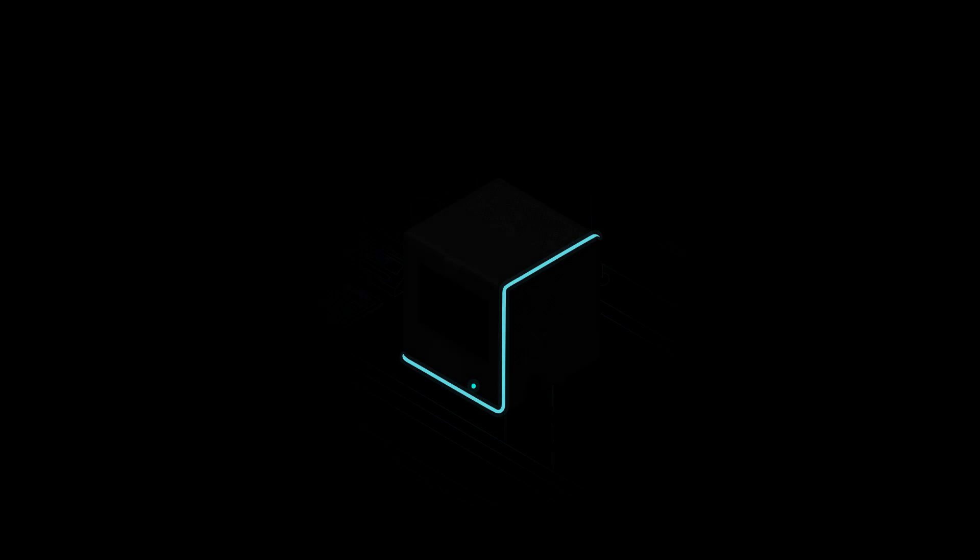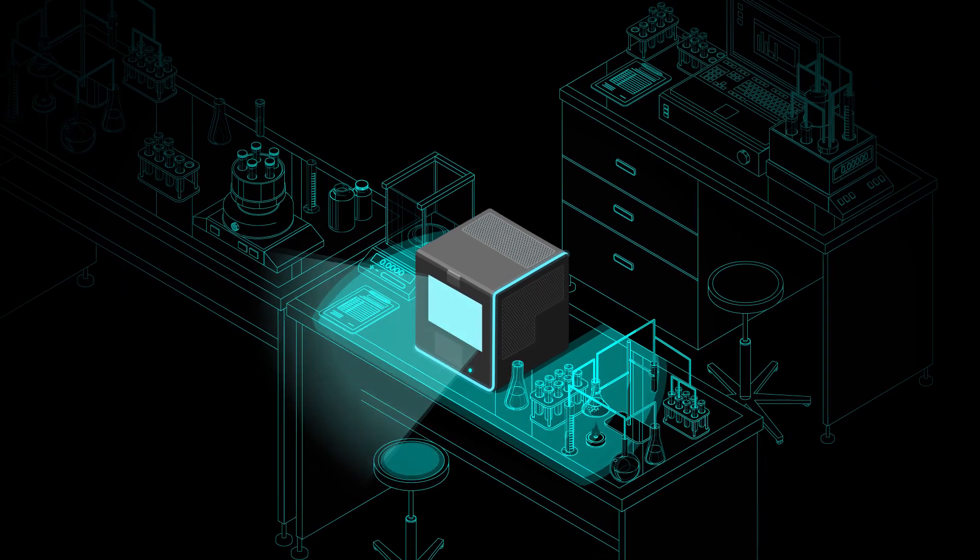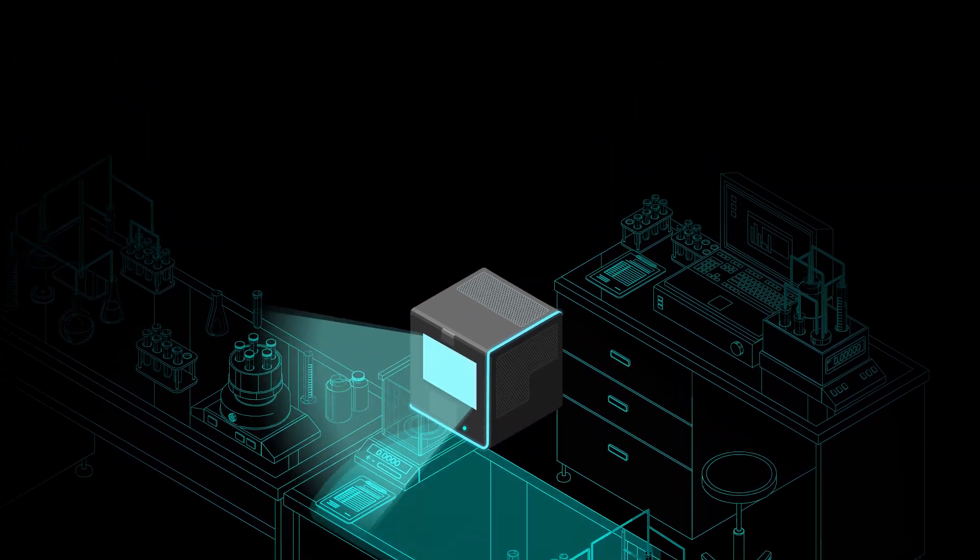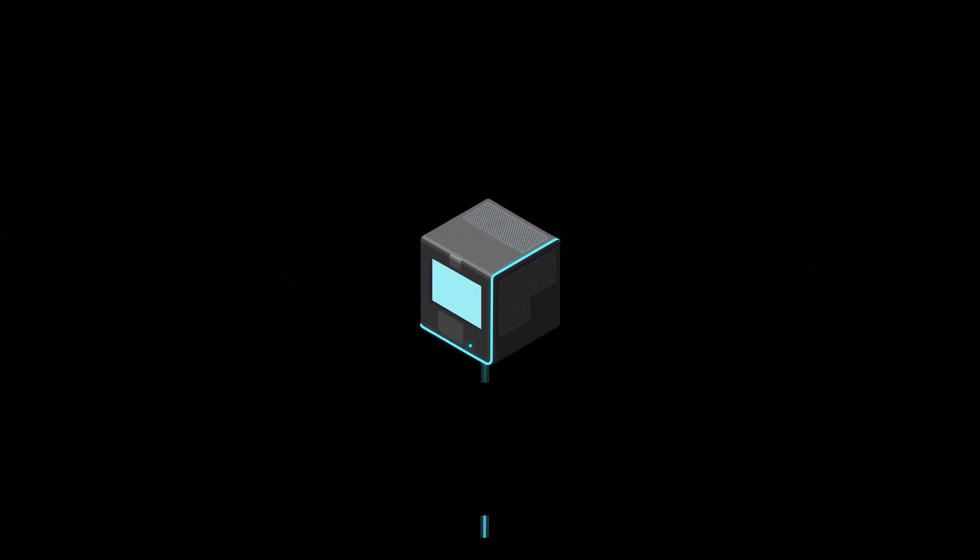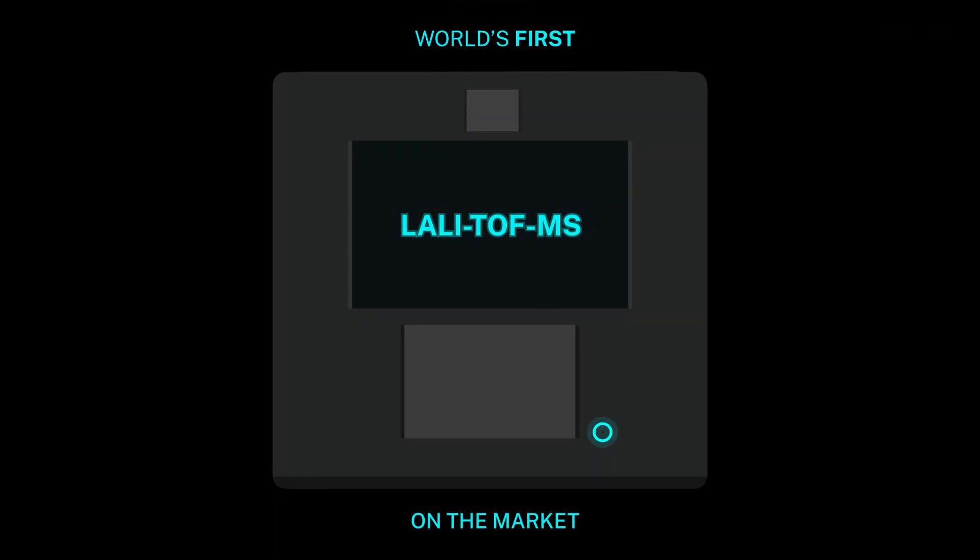What happens when you combine powerful technology with intuitive design? Exum is transforming the scientific instrumentation market with MassBox, the world's first commercially available mass spectrometer using laser ablation laser ionization technology.